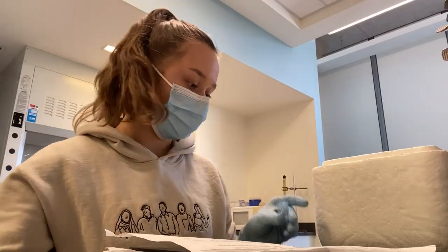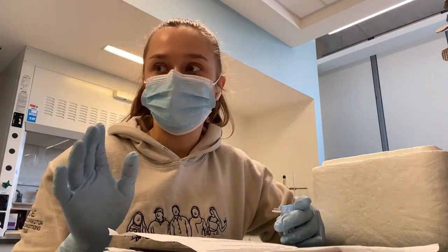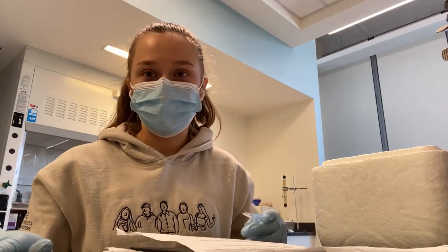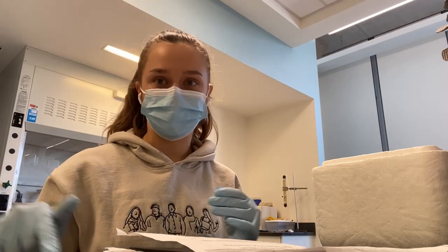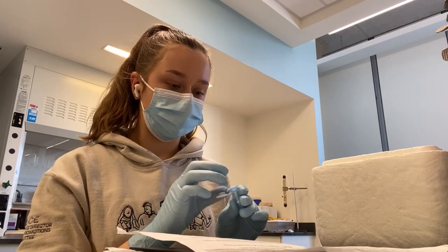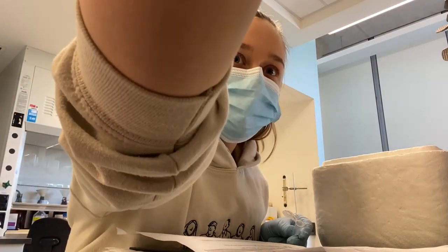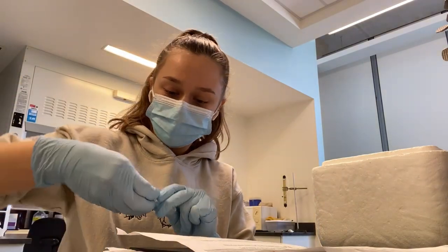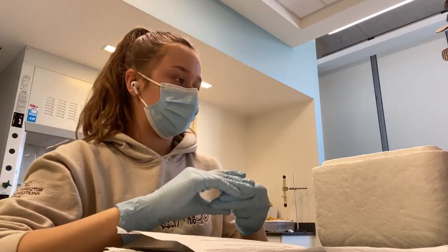Essentially the vibe of the lab is pretty chill. There are three grad students — two PhD, one master's — and three undergrads. We all take turns going in. We have a Google calendar where we put our dates, which days we're going to go in, so we can coordinate who's going to be there and when. They taught me everything I need to know here.